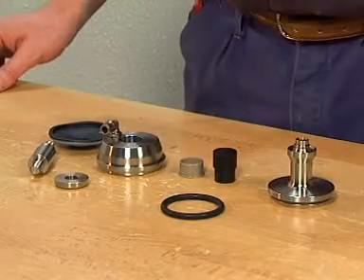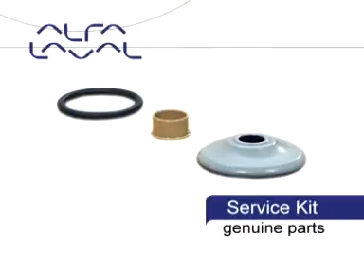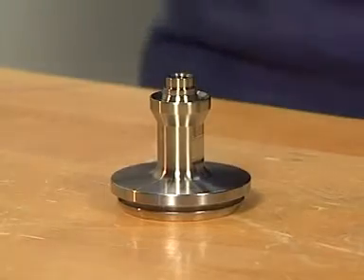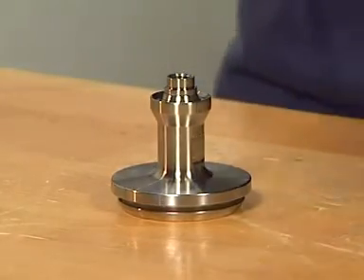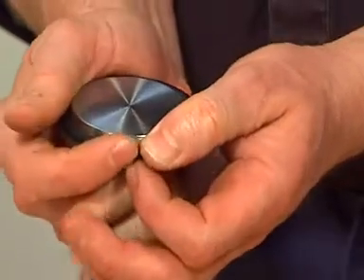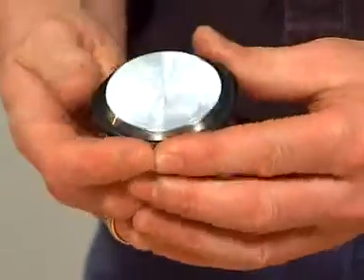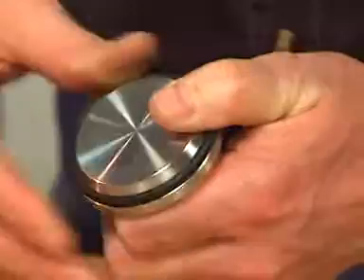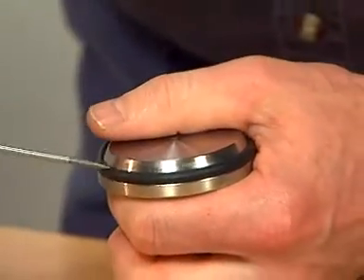Empty the bag with the service kit and check that the contents are correct. Please note that the bushing is not included in the service kit. Refer to the manual before reassembling the valve. Replace the plug seals, placing the new plug sealing and mounting it crosswise to secure a perfect fit. Remember to release the compressed air behind the seal.